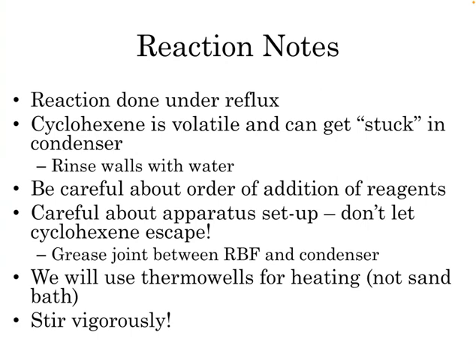So halfway through the reflux, you'll want to rinse the walls of the condenser with water. You also want to be careful about the order of addition of reagents, so follow the procedure step by step. You also want to make sure that cyclohexene can't escape your system, so make sure to grease the joint between the round bottom flask and the condenser.